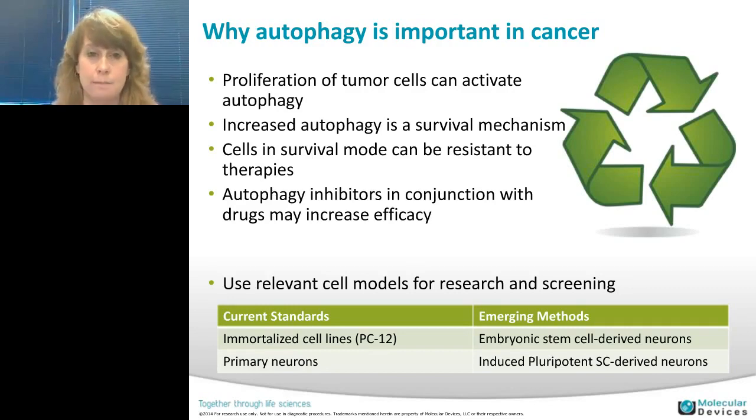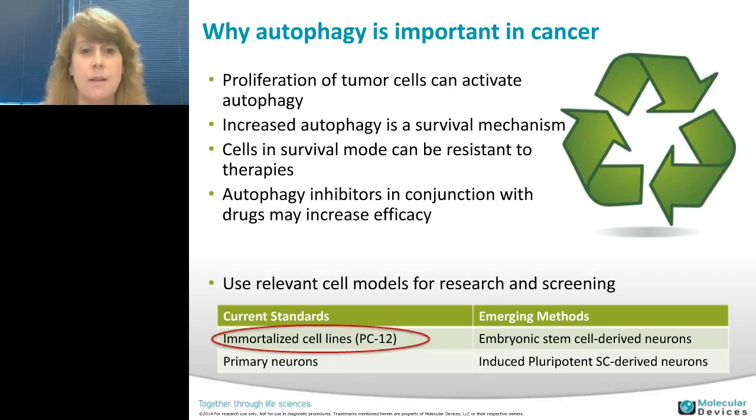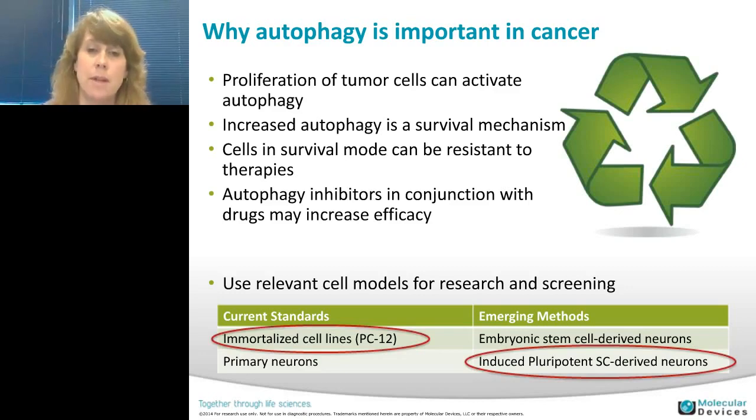their efficacy. We showed an assay using cell lines that are similar to neurons or are neurons. I used immortalized cell lines PC12, which is from rat adrenal gland, and also induced pluripotent stem cell derived neurons from Cellular Dynamics.